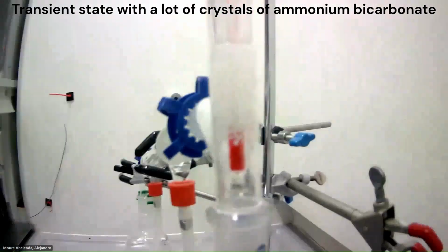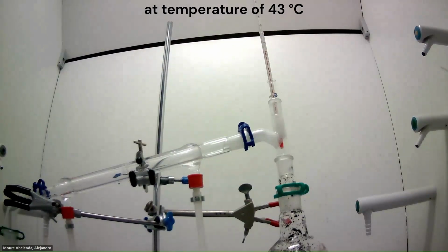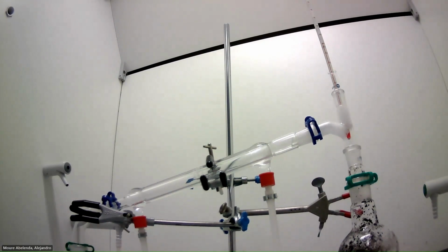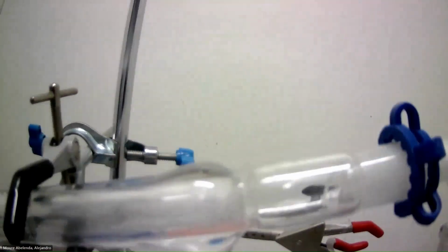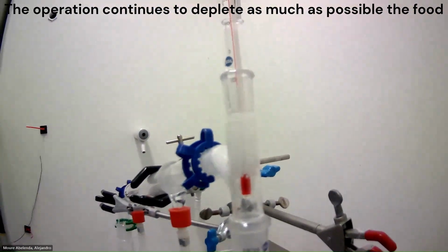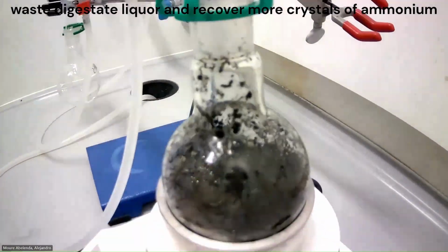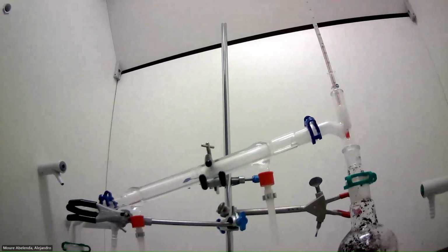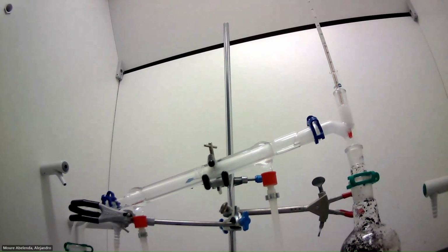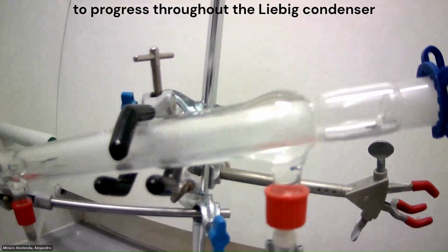Transient state with a lot of crystals of ammonium bicarbonate at a temperature of 43 degrees Celsius. The operation continues to deplete as much as possible the food waste digestate liquor and recover more crystals of ammonium bicarbonate. The deposition of the crystals of ammonium bicarbonate starts to progress throughout the Liebig condenser.